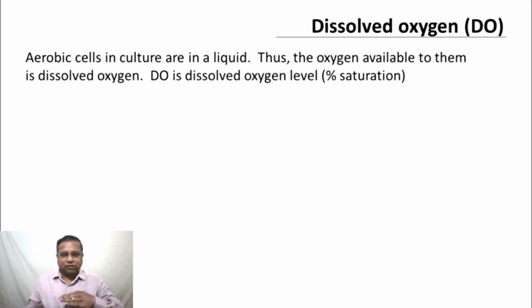So, oxygen is partitioning at equilibrium. You have a certain relationship between the dissolved oxygen concentration in the liquid and the concentration of oxygen in the air, given in different units and so on. Now, when it is saturated with air oxygen, you have a certain amount of oxygen in the liquid. If you change the gas phase composition, of course, the equilibrium concentration in the liquid is going to change.